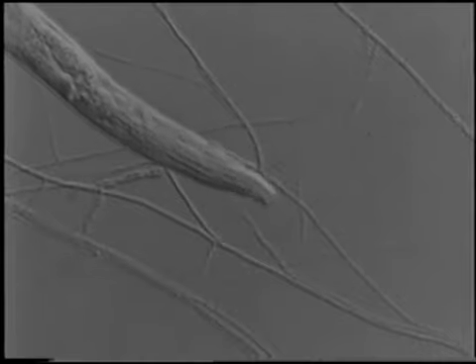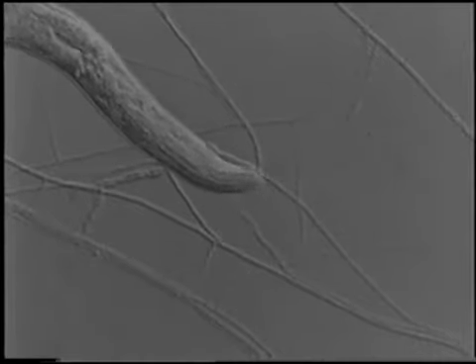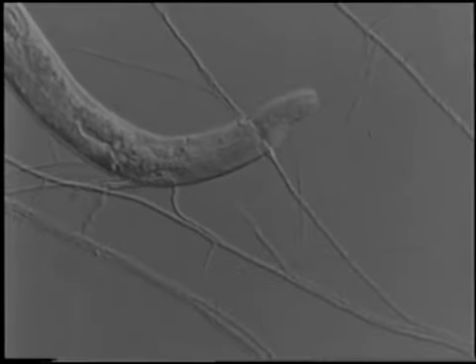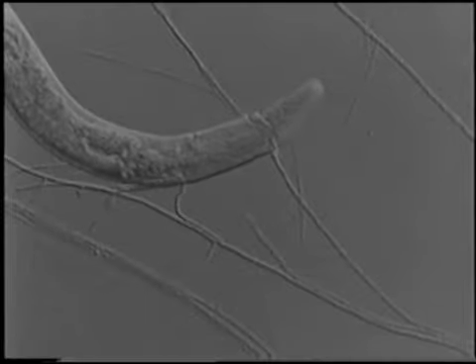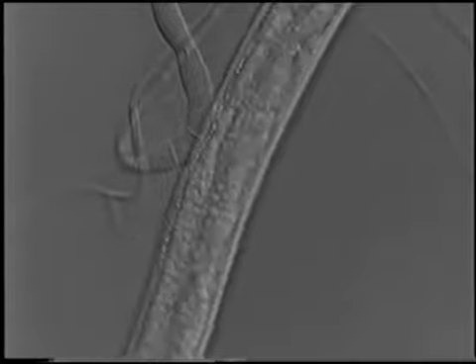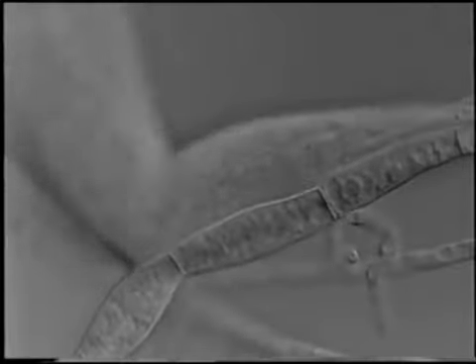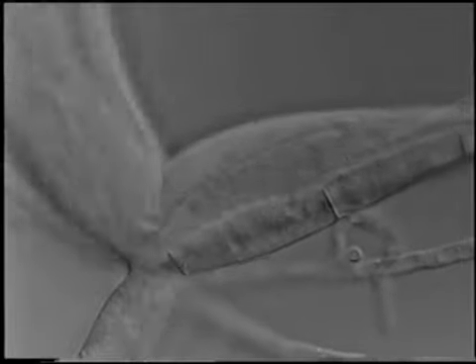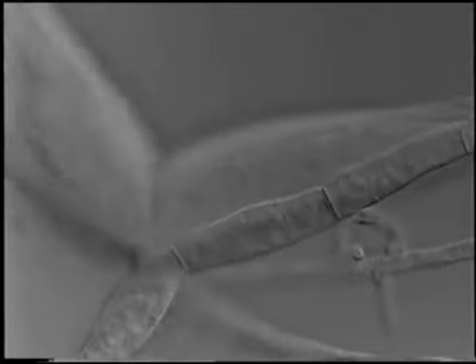Attempts to get free lead to further attachment to the trap on the left. Here, the nematode is captured by 2 of the 5 cells of a branch. It is impossible for the nematode to free itself. In this time-lapse sequence, the effective adhesive is seen to the left. Inside the trap, there is vigorous cytoplasmic movement.